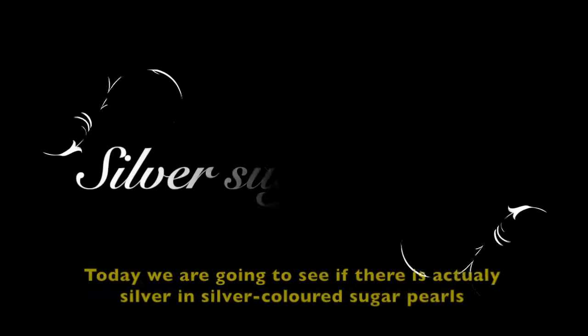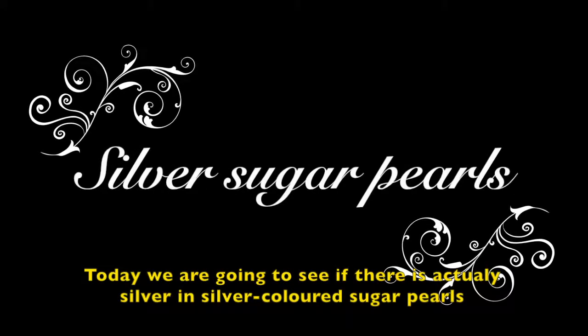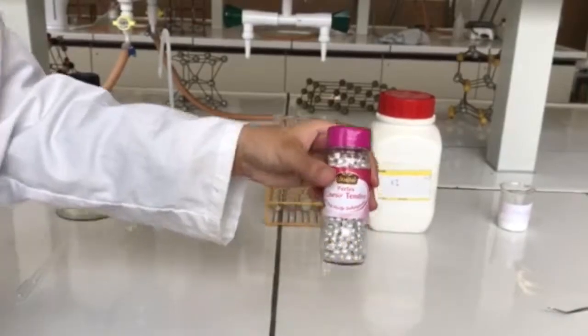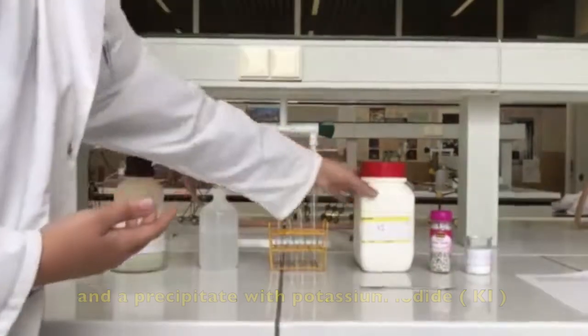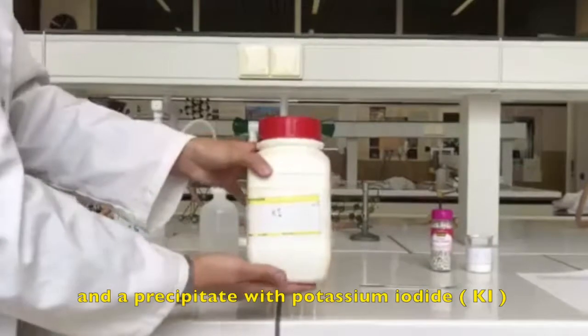Hello everyone, today we are going to see if there is actual silver in silver colored sugar pearls. We are going to prove this with a precipitate of sodium chloride and a precipitate with potassium iodide.